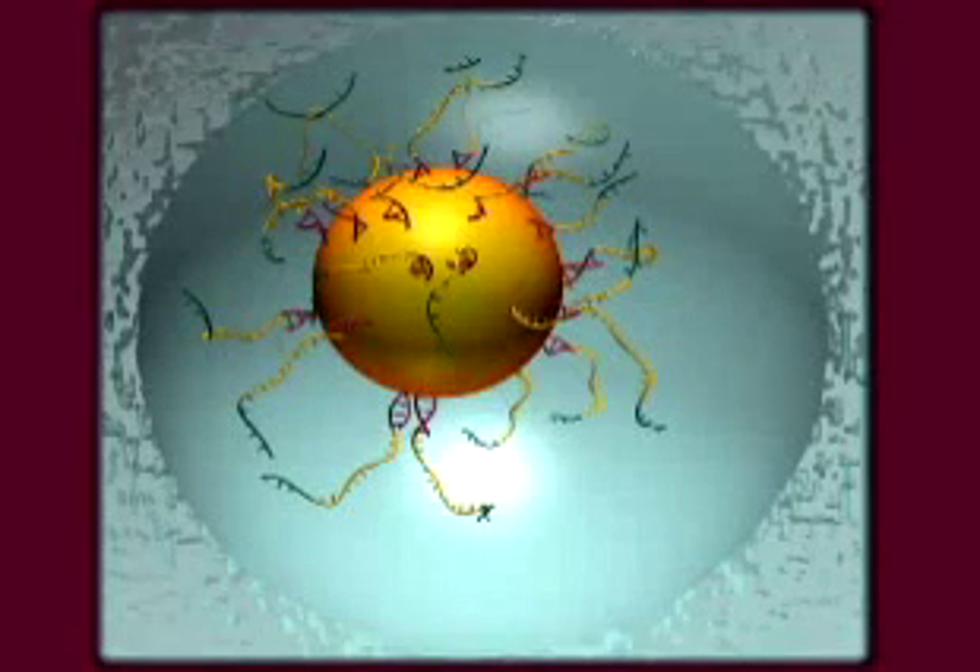We heat to separate the two strands of DNA. Then each bead has a million copies of single-stranded template DNA ready for sequencing. After we centrifuge the tubes to separate the beads from the oil, we're ready for the next step.